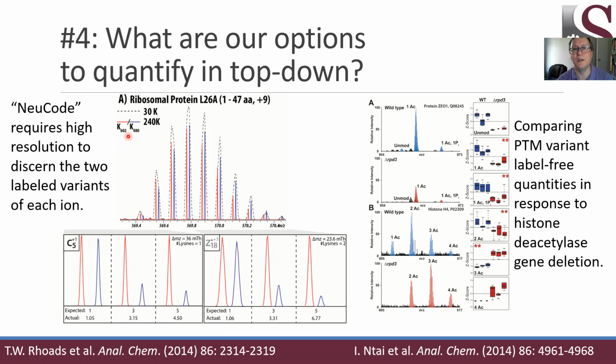The 602 is a code for CHN. So the 6 refers to 6 labeled carbons, 0 labeled hydrogens, and 2, oh, I'm sorry, that's actually a nitrogen, I think. Sorry, CHN. Okay, in this case, the lysine has been labeled with 8 heavy hydrogens. Okay, so you might ask yourself, if you're adding 8 mass units to the red lysine, and you're adding 8 mass units to the blue lysine, aren't they going to show up right on top of each other in a tandem mass spectrum?